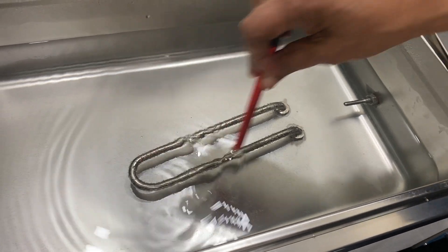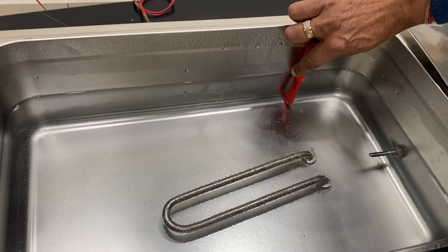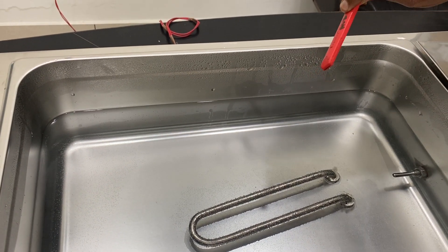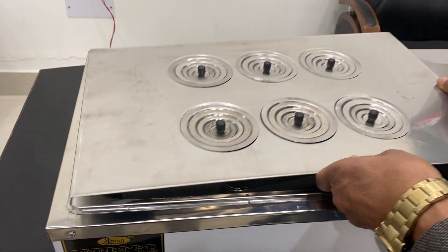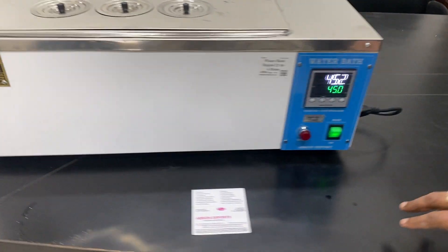This is the heater — water should always be above the heater. I am just showing you: we have put in 10 liters and this is also a 10 liter capacity. The total capacity is 21 liters to the top, but the water level should not be equal to the top unless there is a specific requirement.